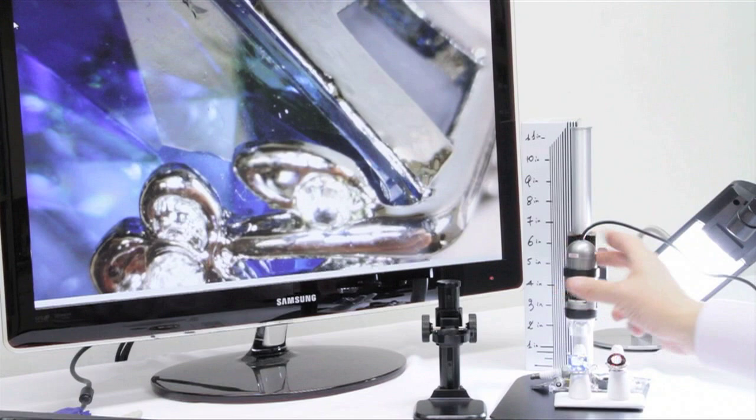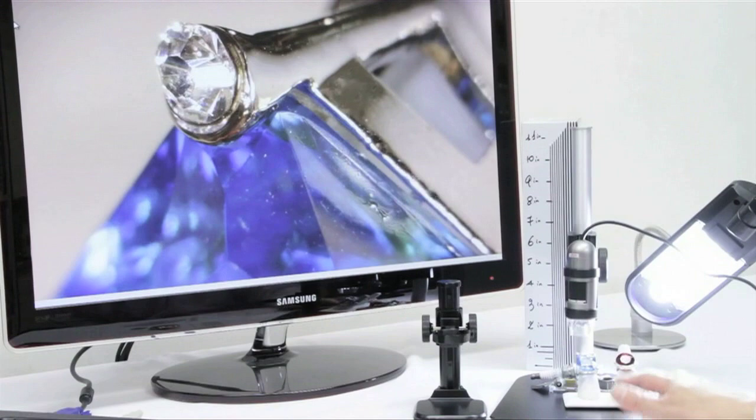This scope is very versatile, enabling you to get the whole picture in focus or just a single part with high definition, high magnification.